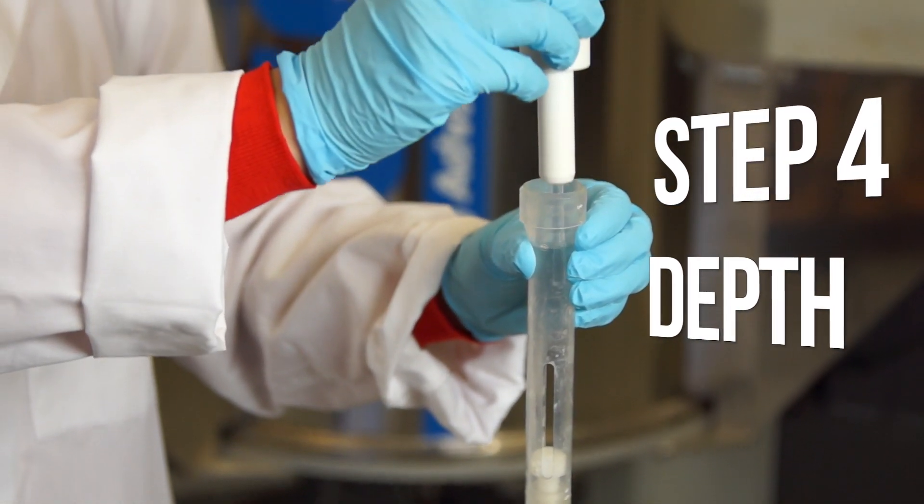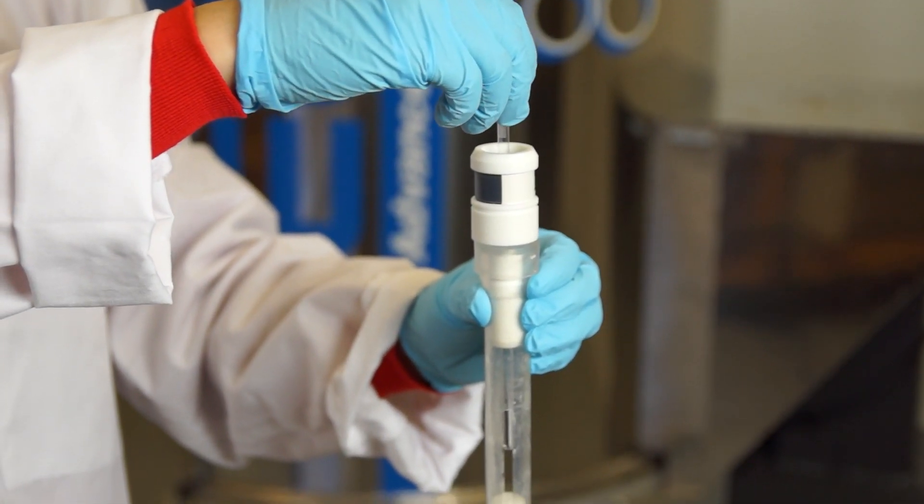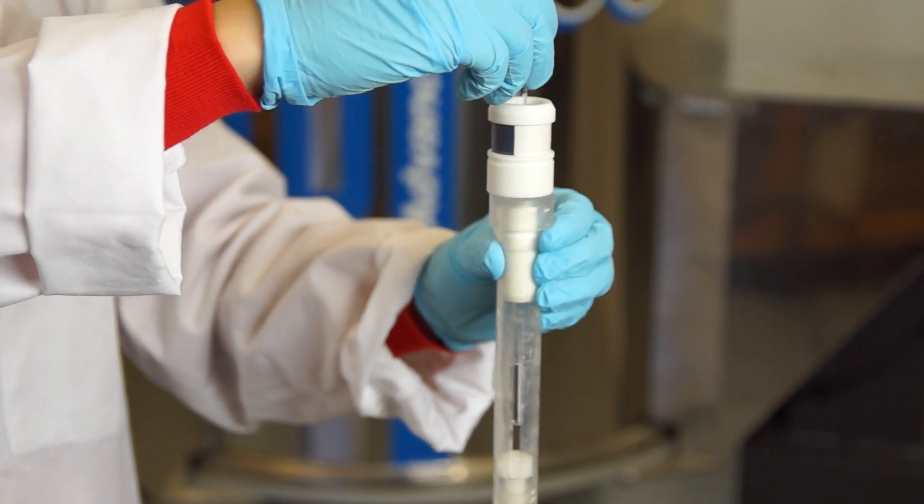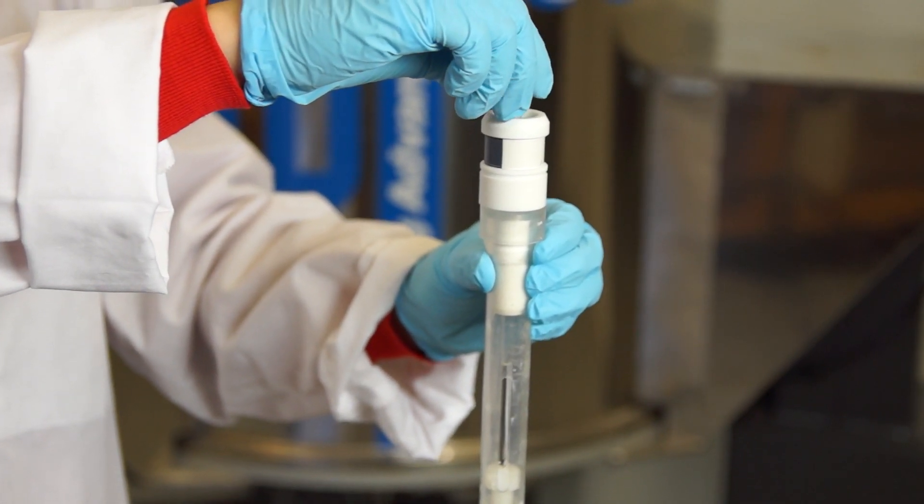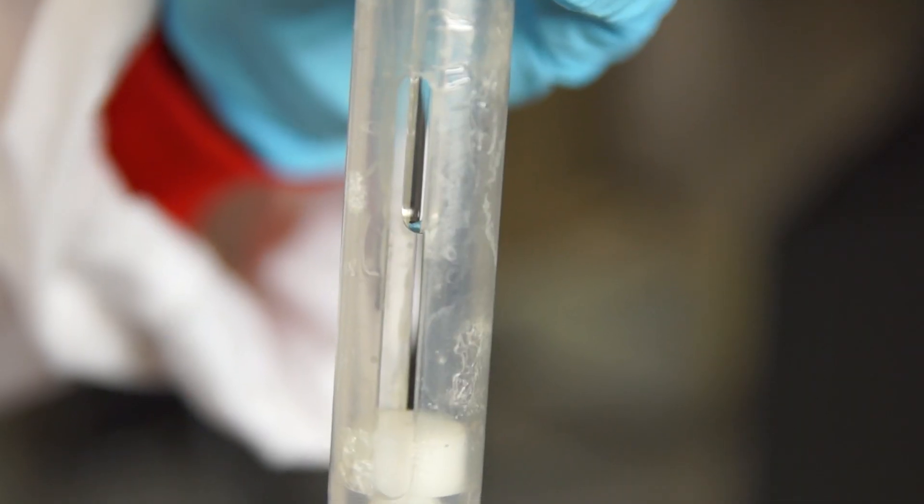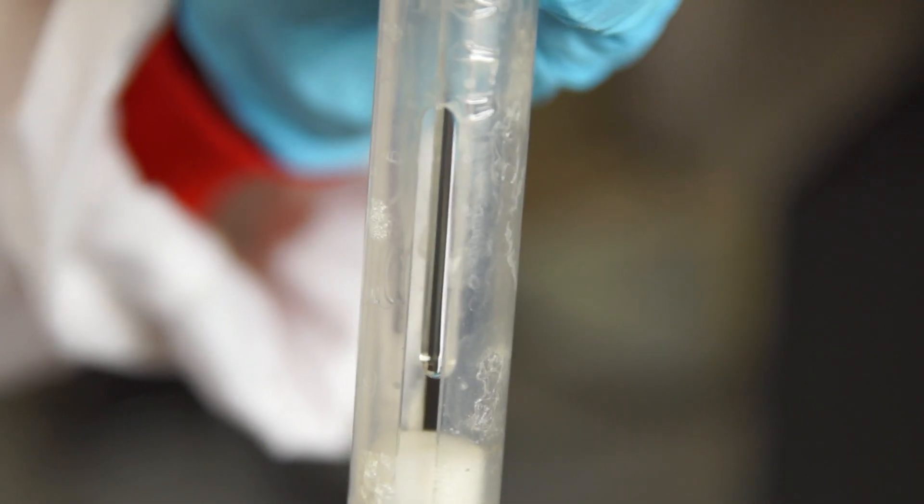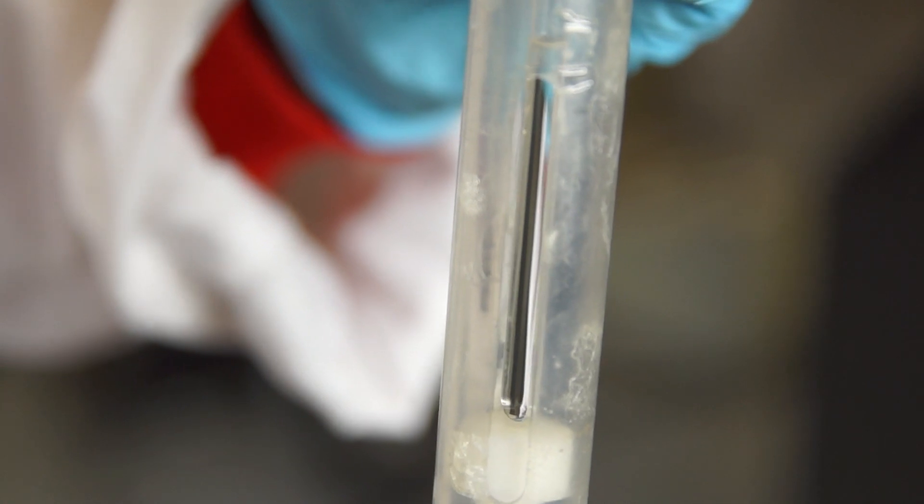Step 4 is to check how far to push down the NMR tube. Use the depth gauge. And now, push down the NMR tube gently until the bottom of the tube hits the plastic at the bottom of the depth gauge. They should just barely be touching.